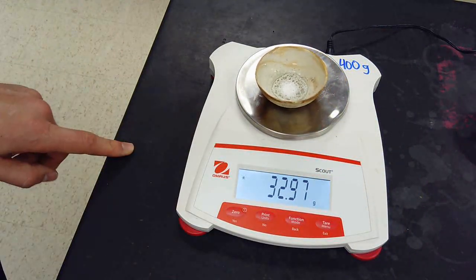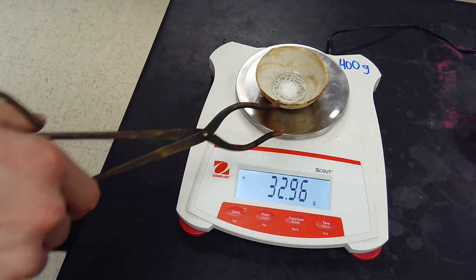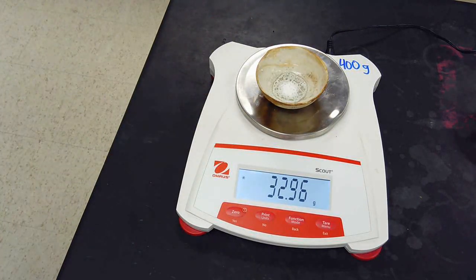Let's take a look at that. Okay, now with this one, I'm going to show you one thing and see if you could figure it out. We're going to put it back on the Bunsen burner and see what happens. Okay, watch this.